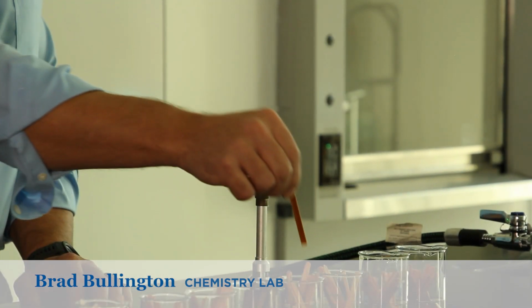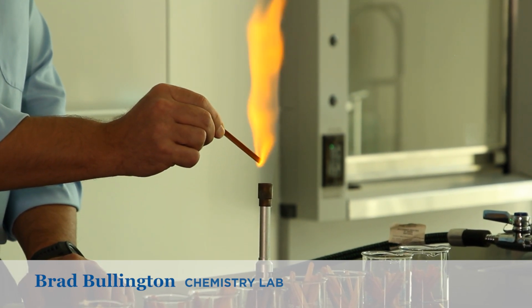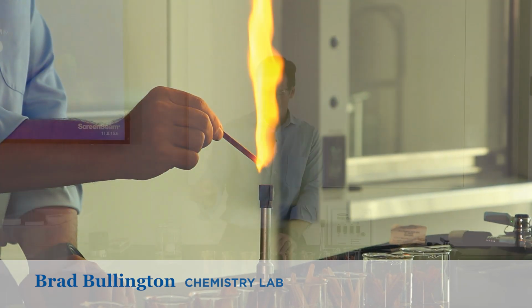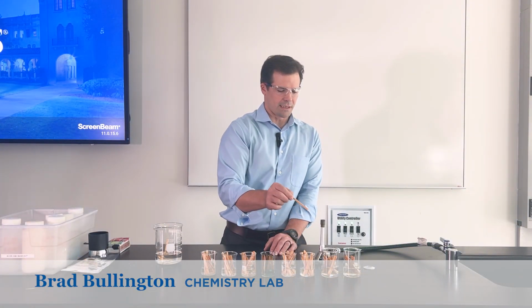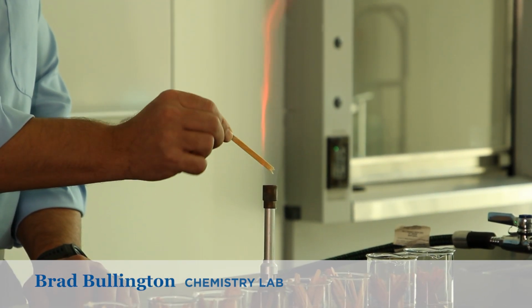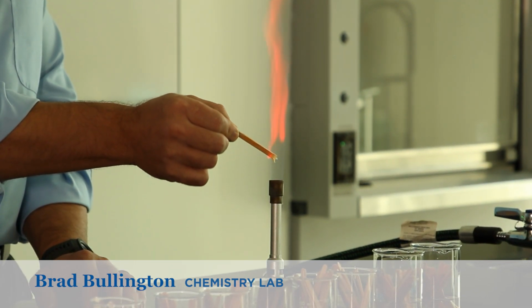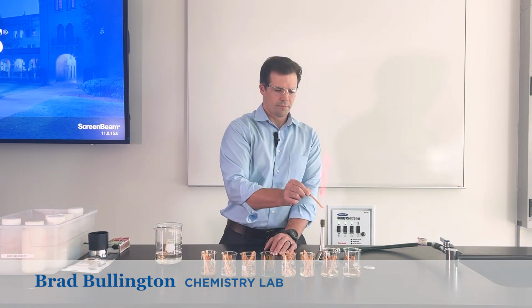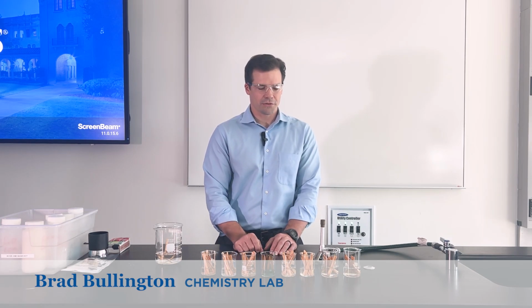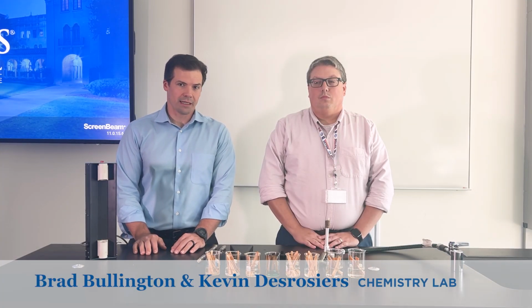Now be careful because this one's very similar to calcium. And finally, strontium. And if you want to see the metals that are in the other two containers, you'll have to enroll as a student. The second part of our flame test lab is a bright line emission spectrum lab.